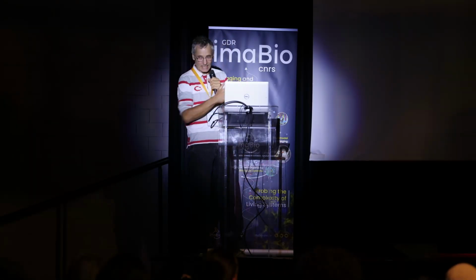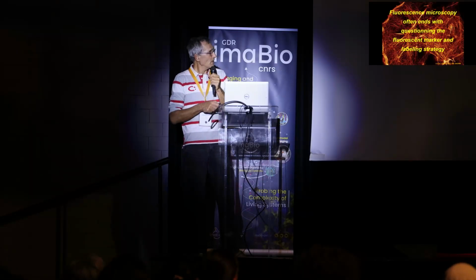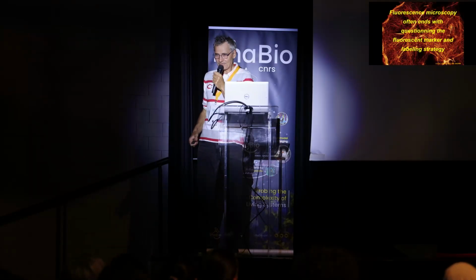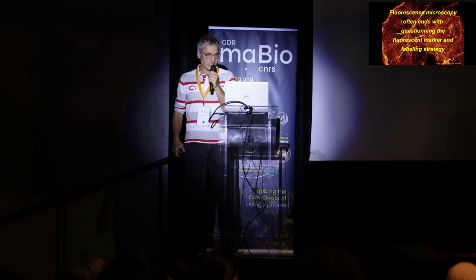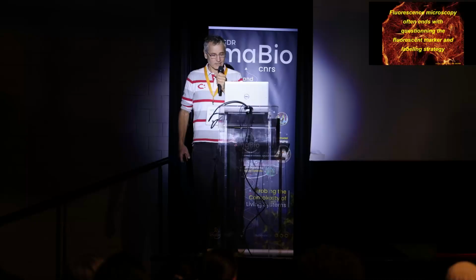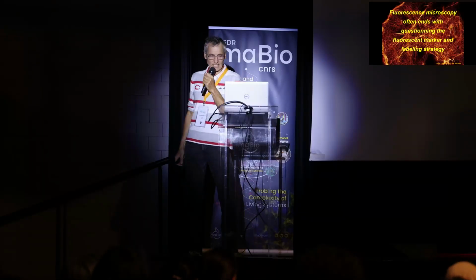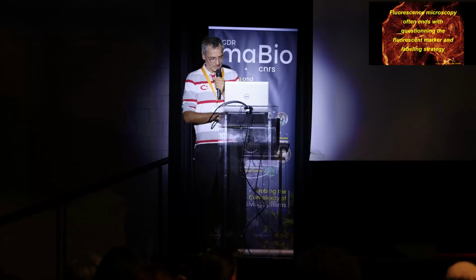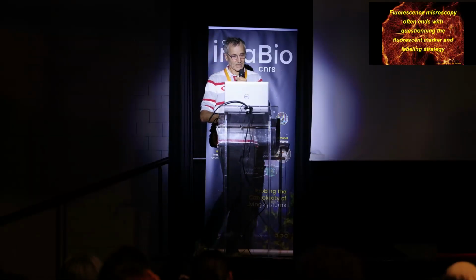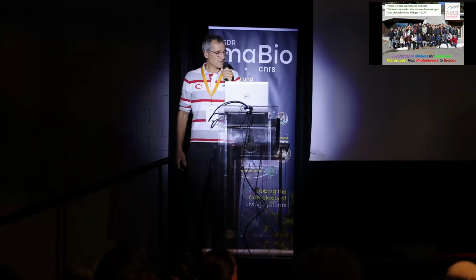So that's it. I hope I convinced you about the importance of fluorophores, and at the end of the day, very often, I think this is what happens. If you're not really fully happy with the results, you start questioning if your fluorescent marker and your labeling strategy are just the right ones. So you better think twice before engaging into a certain labeling strategy.